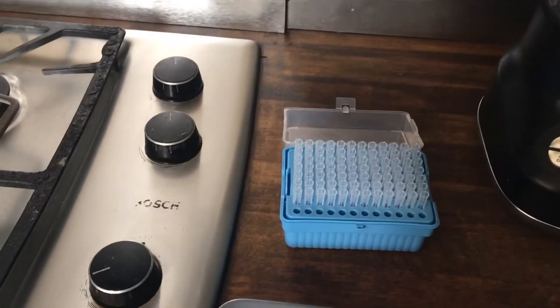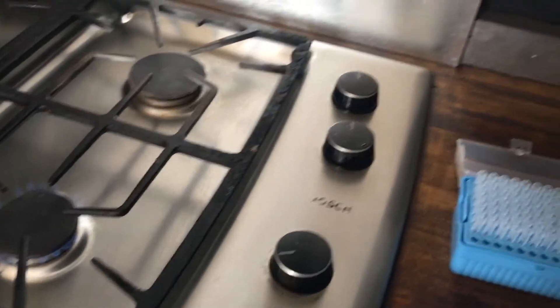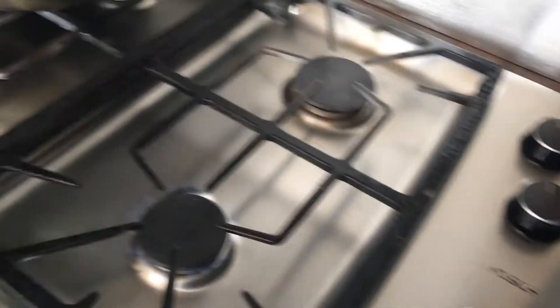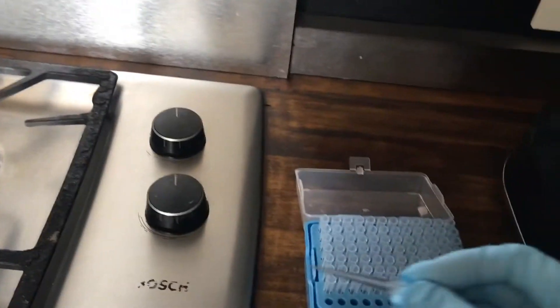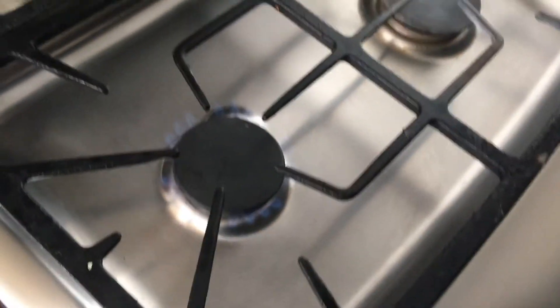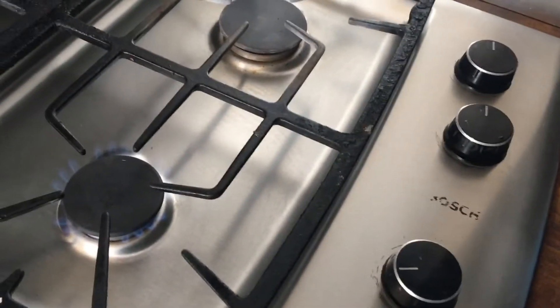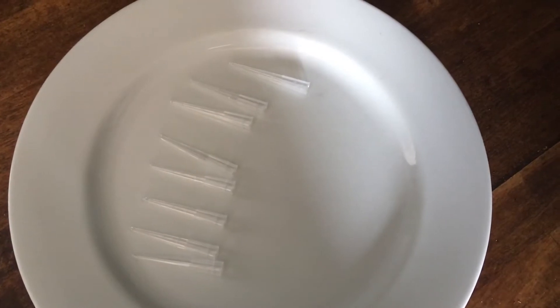You're also going to need eight pipette tips with melted tips — these are really like tiny little pestles. Buying pestles is quite expensive, whereas if you make them yourself by melting the tip of a pipette, that's a lot cheaper. So I'm going to make eight of those.